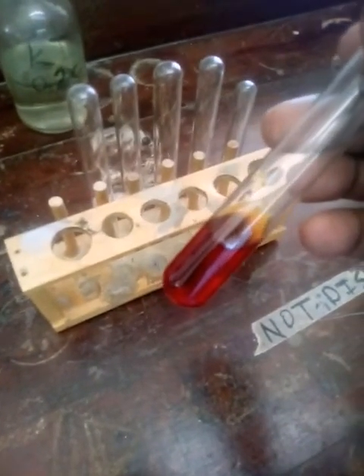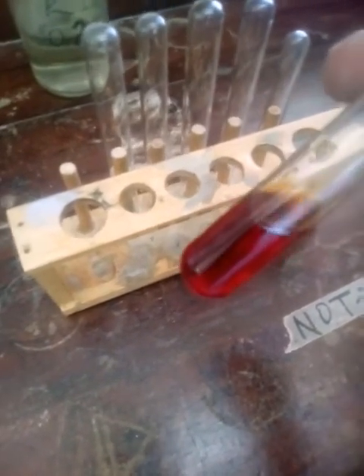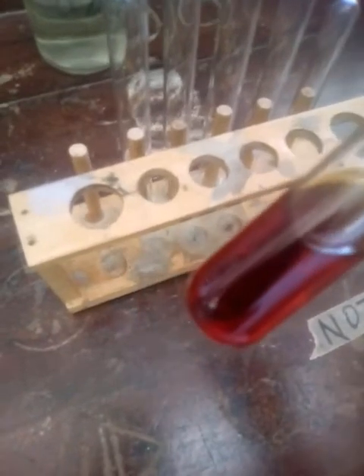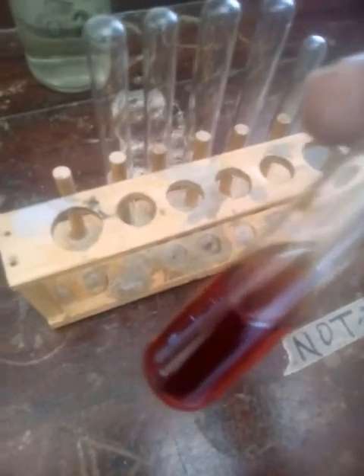I could say this is a reddish brown. A reddish brown mixture was formed at the end of the reaction between potassium iodide and hydrogen peroxide.